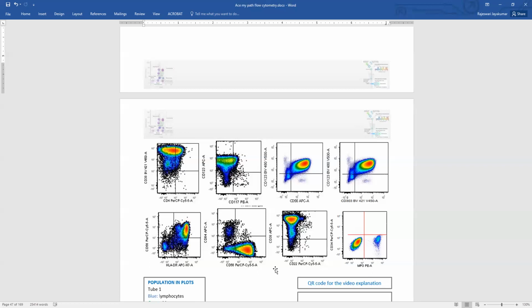And if it is positive for all three, and negative for other lineage specific markers, we can call it BPDCN. But individually, none of these are specific for PDCs, because CD123 can be positive in myeloid cells. CD56 again can be positive in a lot of myeloid neoplasms. CD4 again can be positive in AMLs and monocytic neoplasms. So that's why they do rule out monocytic lineage. Like for example, here we see that these are clearly CD64 negative. So you need to make sure you don't overcall something as BPDCN just because it expresses CD123.